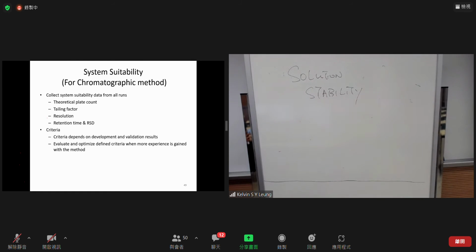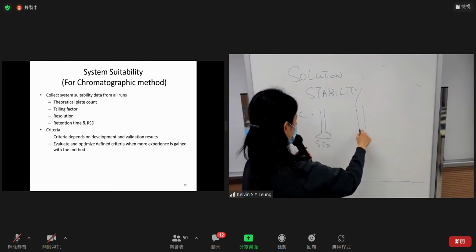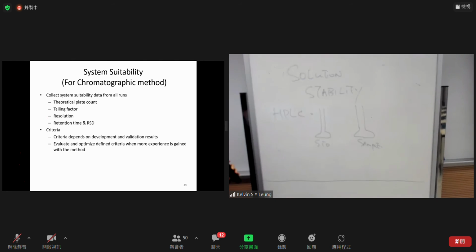Because normally, let's say in HPLC, you prepare your standard and your sample. You don't know how stable these prepared solutions are.